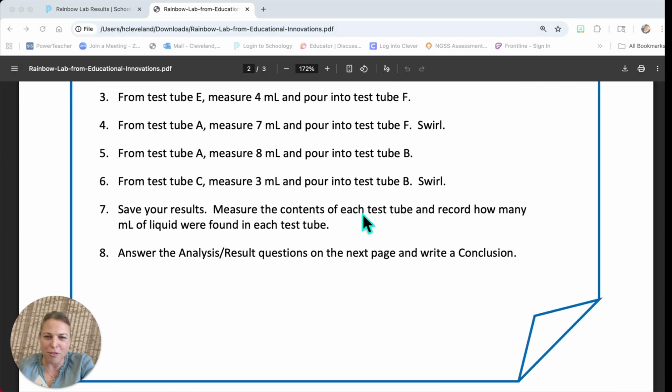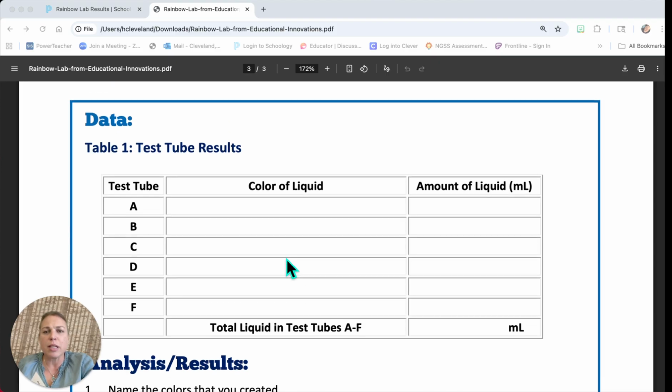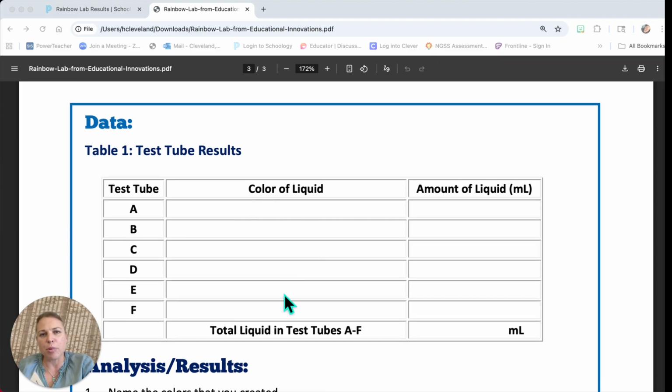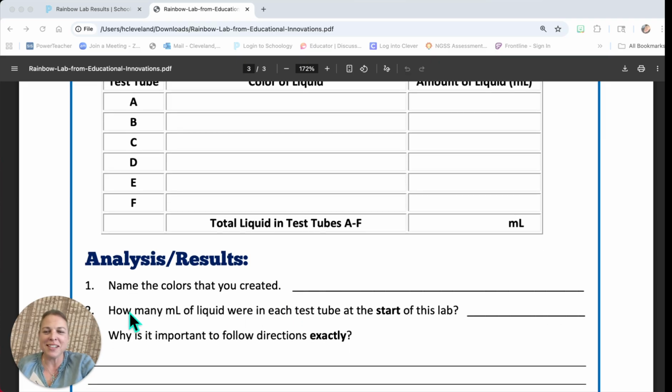One other addition I forgot to mention, in the report, I give them a clipboard and I give this report on paper. It's a wet lab, so I try to keep the devices put away. And this question here, how many milliliters of liquid were in each test tube at the start of the lab? Well, technically at the start, there's nothing. So I've changed that, how many milliliters of liquid were in each test tube at the start of part 2. So I just add that in on their paper copy.